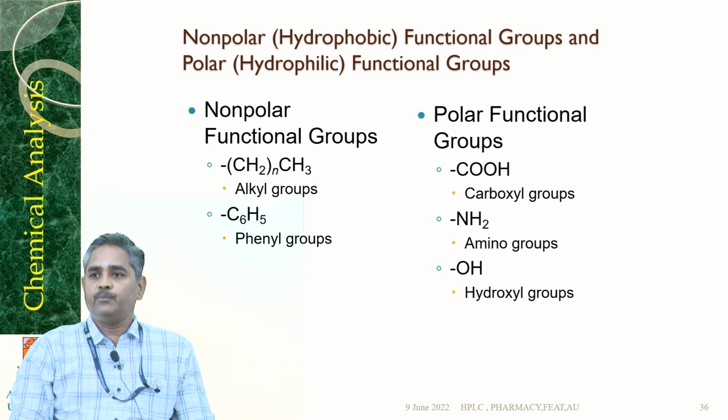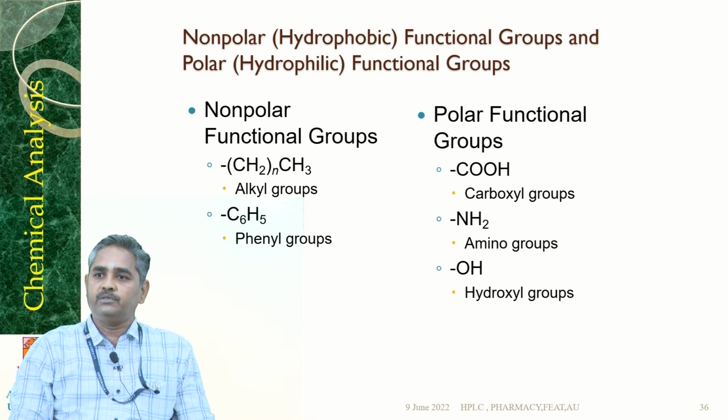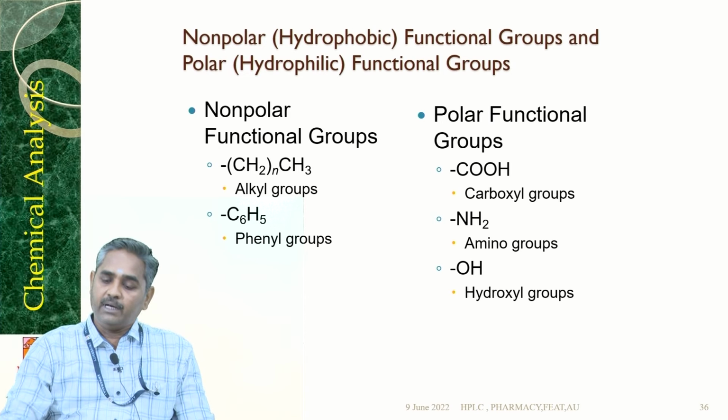Non-polar functional groups and polar functional groups: alkyl groups and phenyl groups are non-polar functional groups, and polar functional groups are like carboxyl group, amino group and hydroxyl groups.